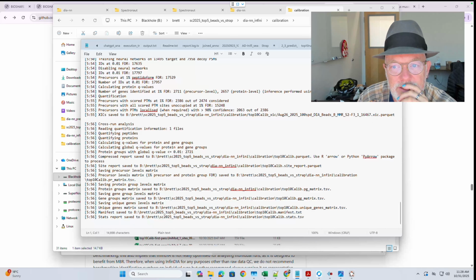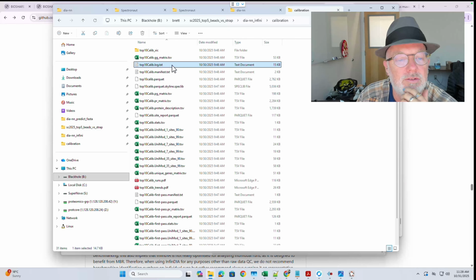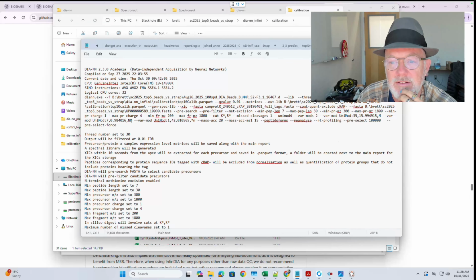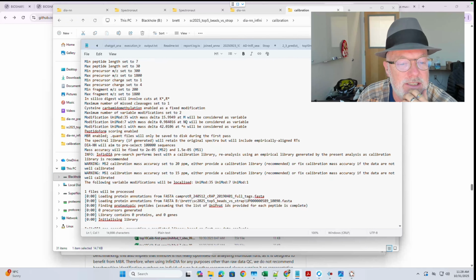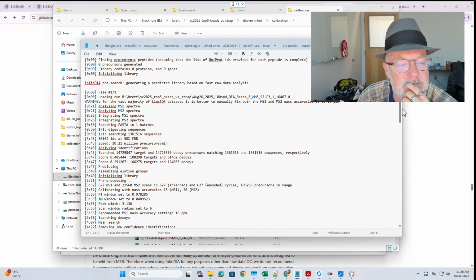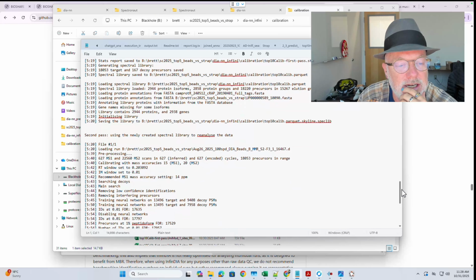It's definitely in one of these files somewhere. So if you search for it, it'll tell you what to set your MS to. I swear it was in the log file. Maybe not. Anyway, we'll come back. Maybe I'll find it and put it in the comments section. Let's see. Anyway, I won't mess with it right now.